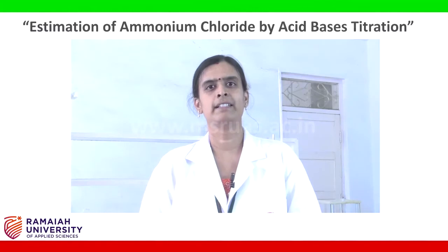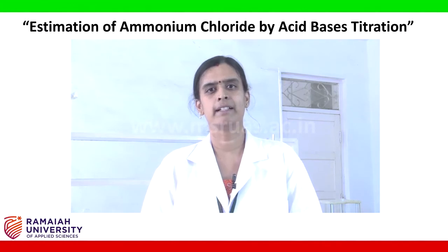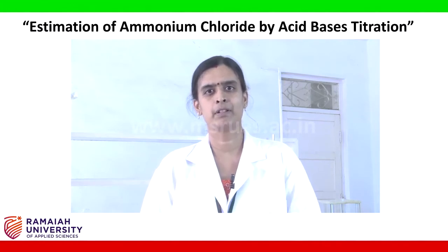Hi students, the name of the experiment is assay of ammonium chloride. The aim of the experiment is to determine the percentage purity of the given sample of ammonium chloride by acid-base titration. The assay is based on acid-base titration and the method involved is alkalimetry.